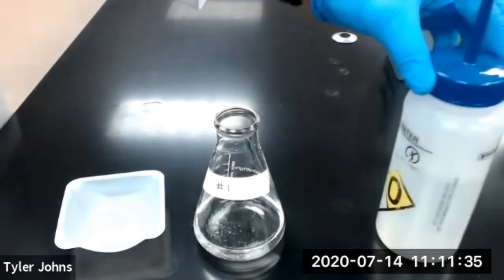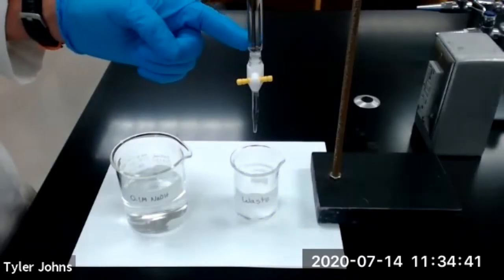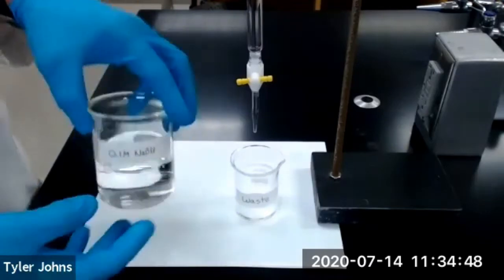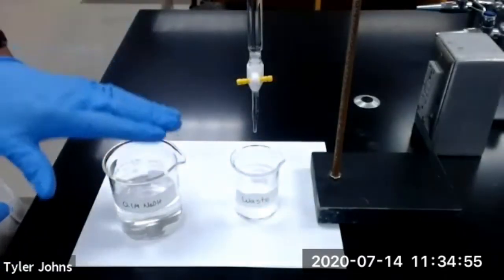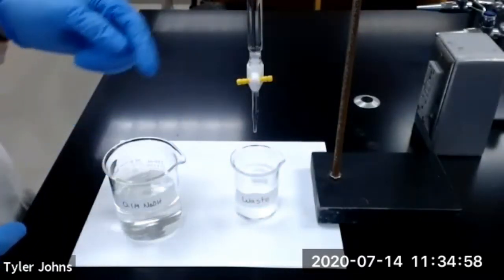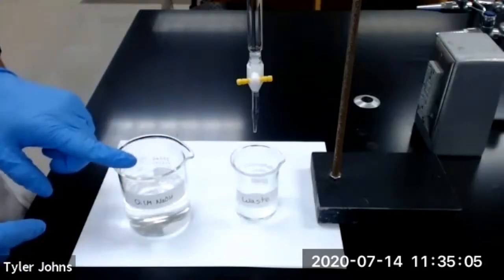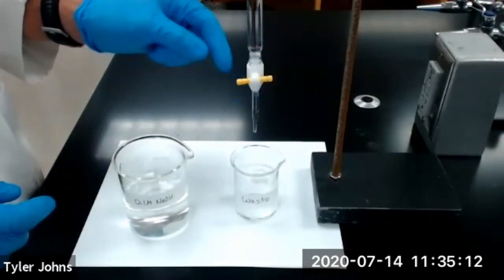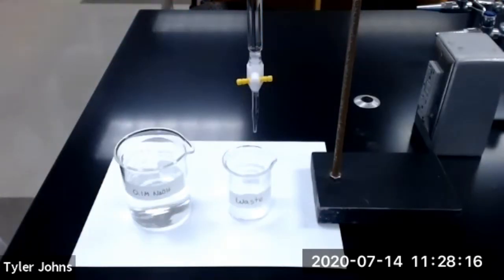While our KHP is dissolving, we'll go ahead and prepare our burette for titration. I've prepared our burette by washing it with deionized water and a small amount of soap, then rinsing it several times with deionized water. I then added 5 milliliters of our 0.1 molar sodium hydroxide working solution to wash and remove any residual water. I then filled the burette and opened the stopcock to remove any bubbles from the tip. Our burette is now prepared for titration. If you would like to view how to properly prepare the burette, please refer to one of the previous titration videos.